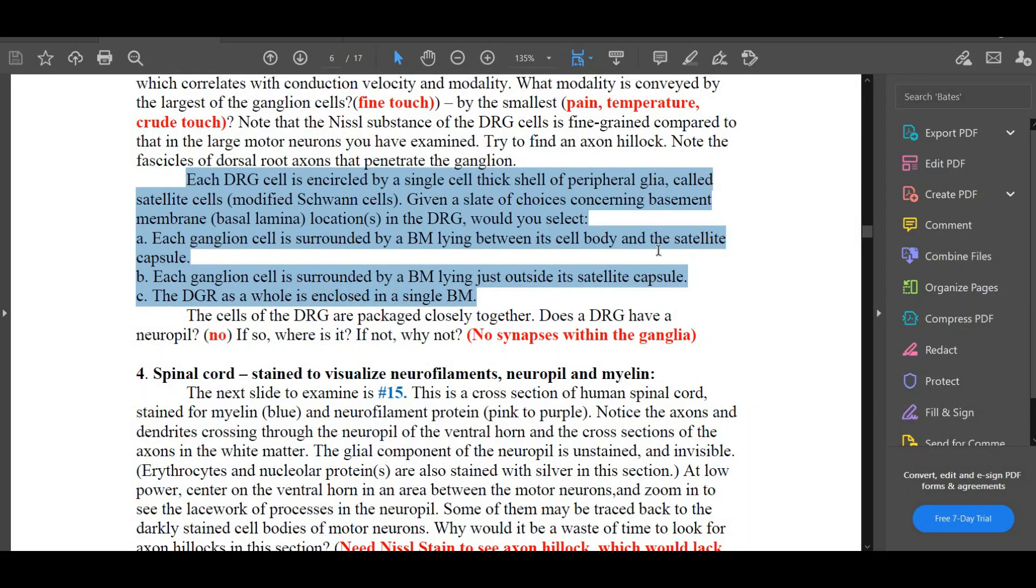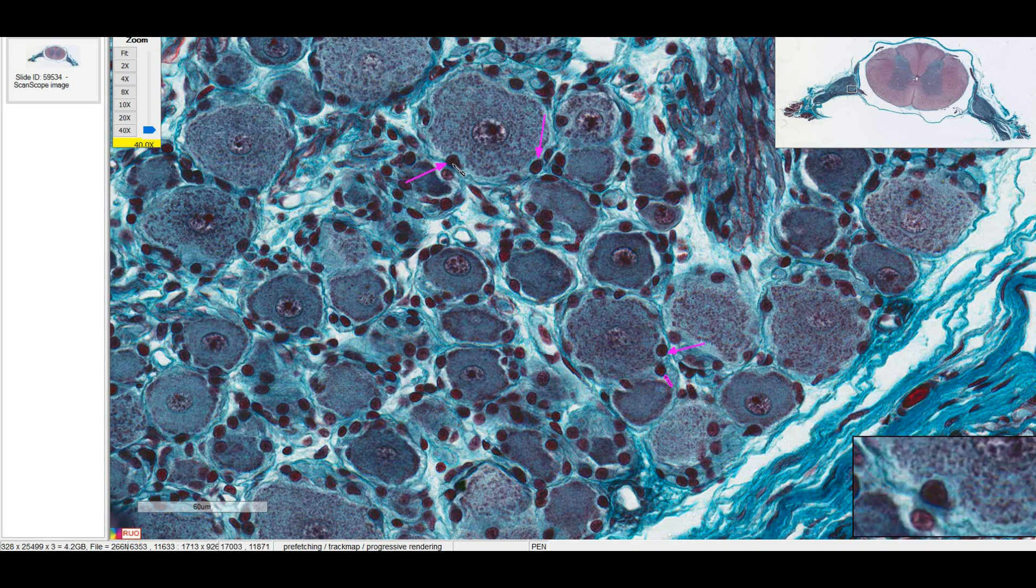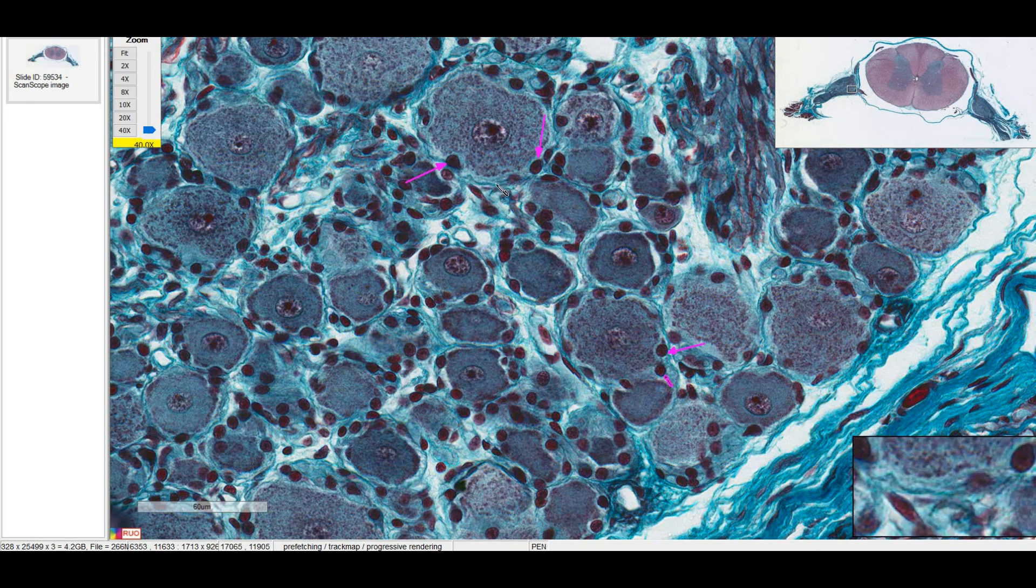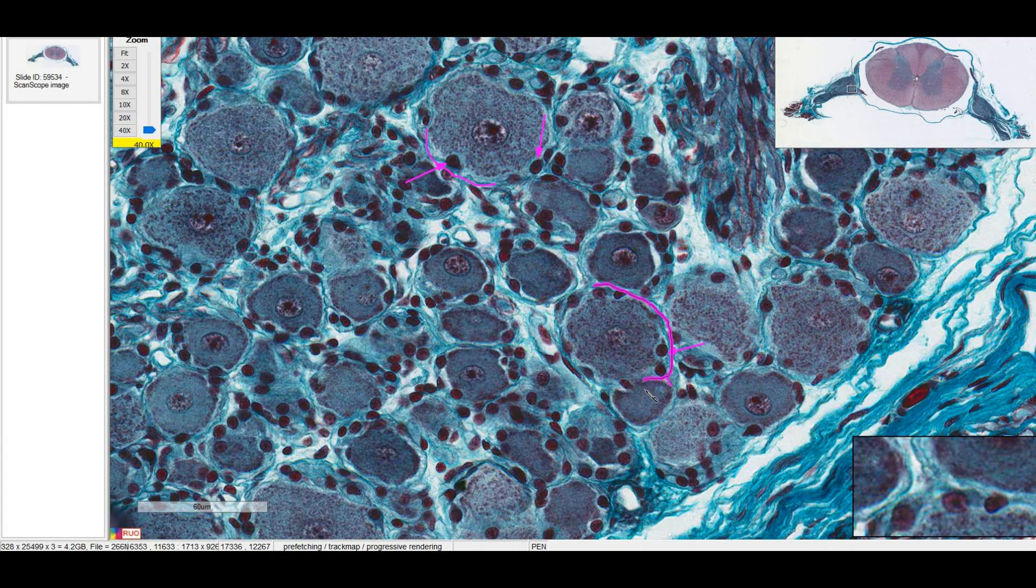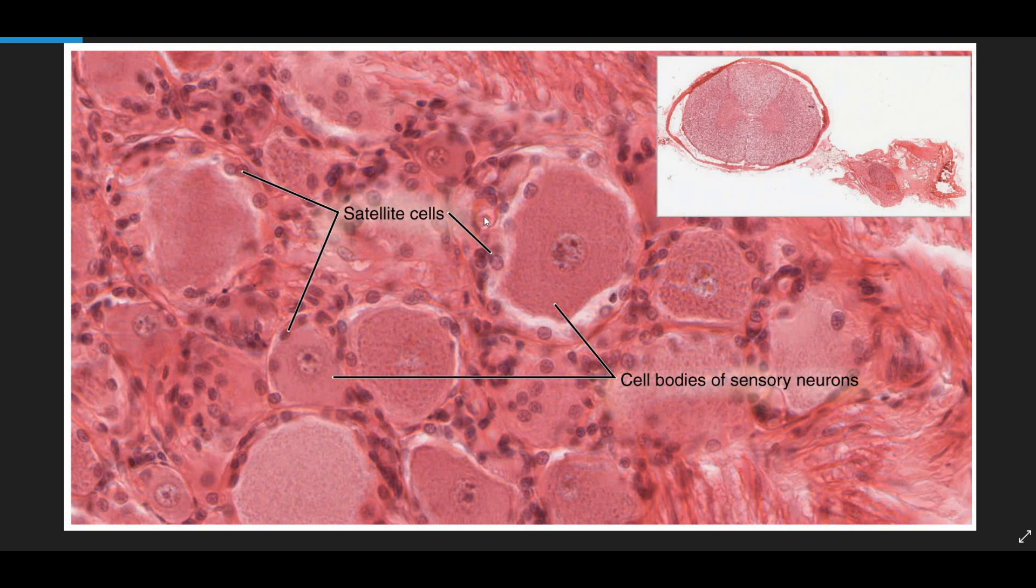There's this question in the histolab manual that is a little confusing. It's asking about where these satellite glial cells are relative to the neuron and the basement membrane of the neuron. I was a little confused about this myself. So I did check with Dr. QB, the answer is B. The satellite cells are inside the basement membrane, directly interacting with the ganglion cells. That makes sense if you think about it. If their job is to nourish the neurons, they're going to be intimately connected with it. If you look closely, you can see if this is the basement membrane, it looks like these are inside. I think that's even clearer on this picture from the Wikipedia page on satellite glial cells. Here's the neuron cell membrane, the neuron cell body, the basement membrane, and these satellite glial cells are inside.